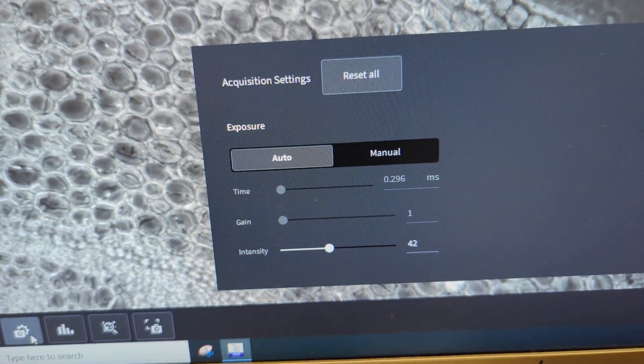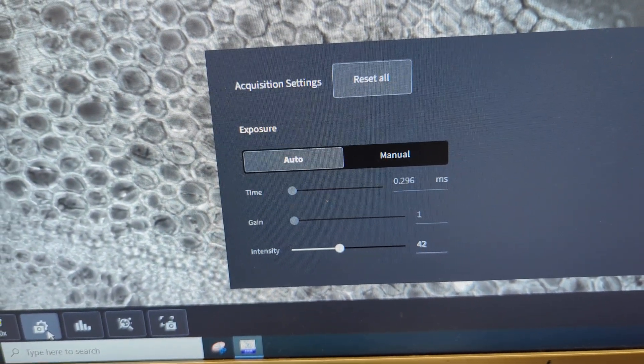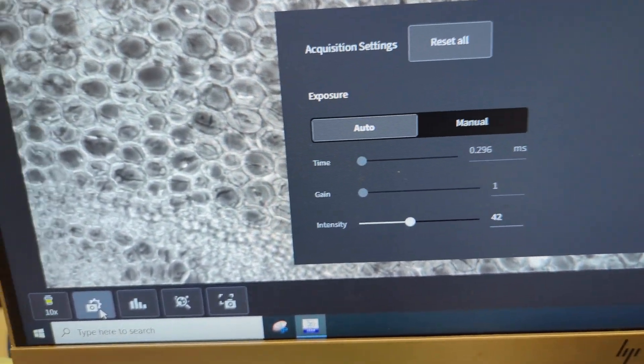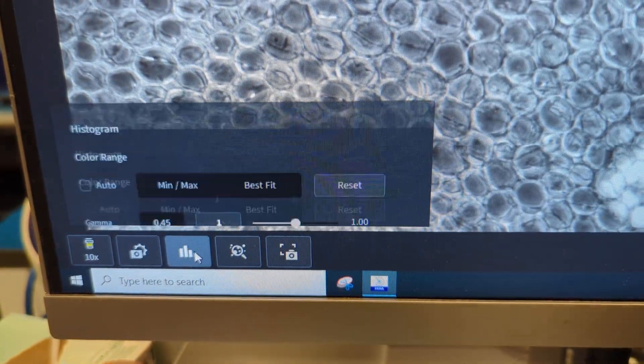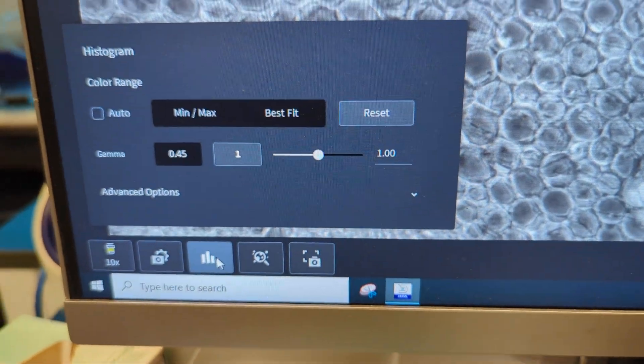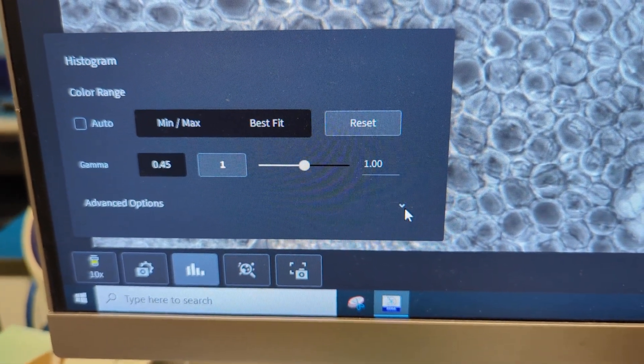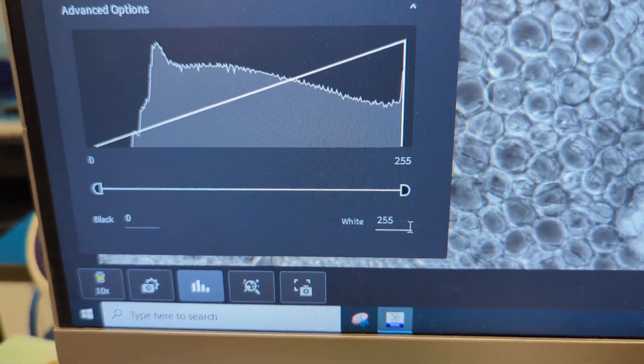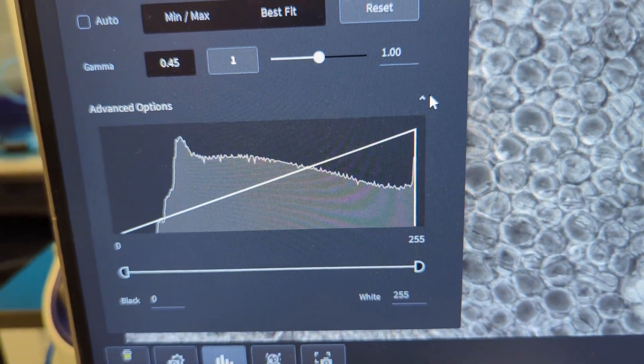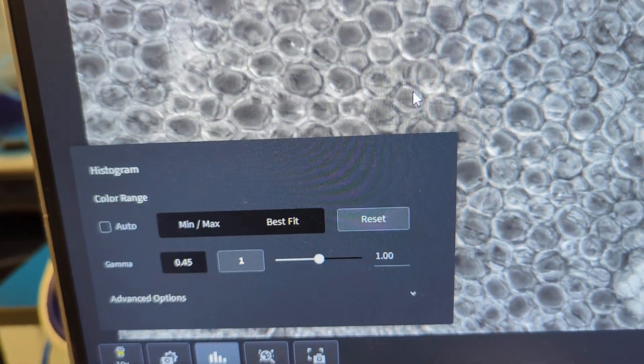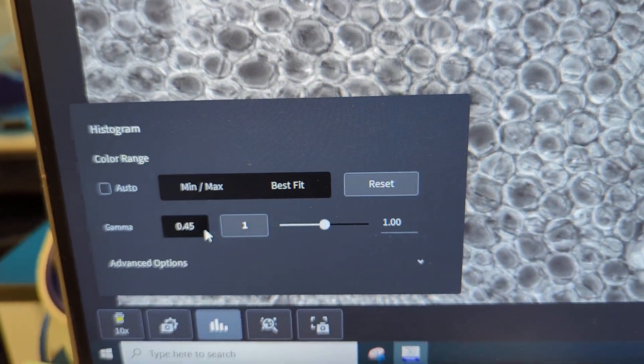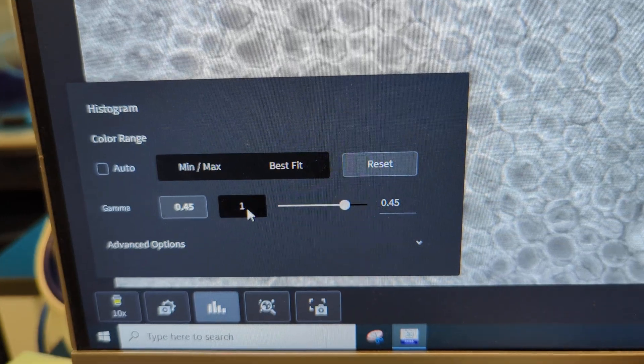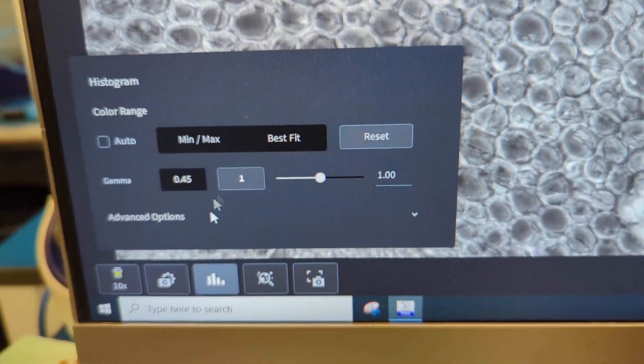This is your exposure adjustments or your acquisition settings, and then this one is your histogram. And you can see the histogram is buried right here in that little caret, but the most I ever do is just adjust the gamma, like this.